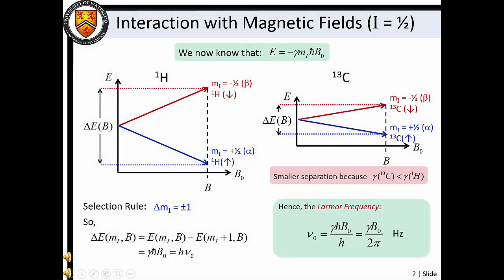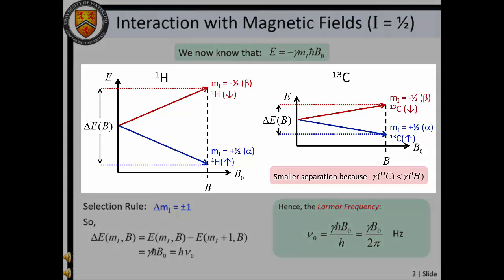In Masterclass 4, we discuss the Zeeman effect, which is the interaction between the internal magnetic moments of electronic quantum states with external magnetic fields. Nuclei that possess quantum spin also have magnetic moments that can interact with externally applied magnetic fields. This interaction forms the basis of nuclear magnetic resonance, or NMR spectroscopy.